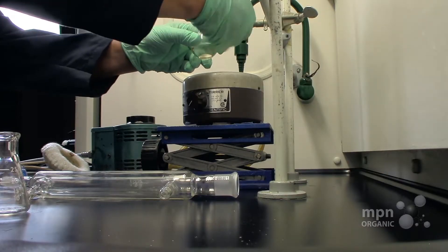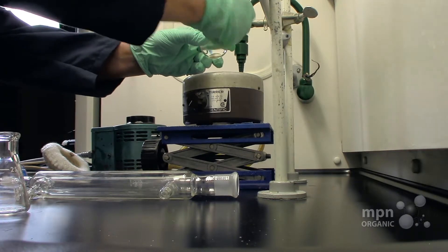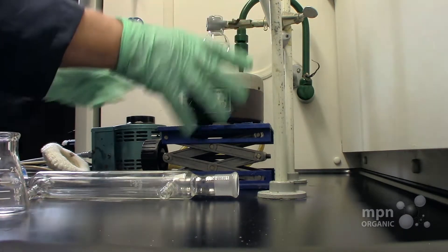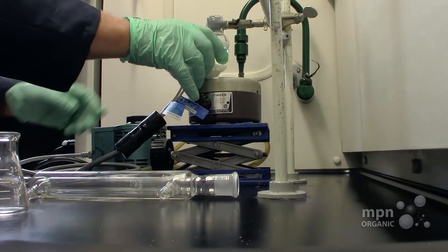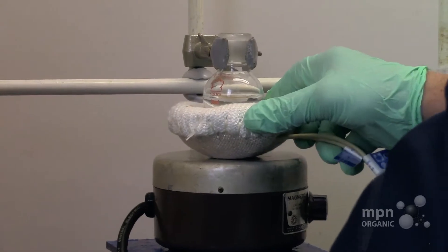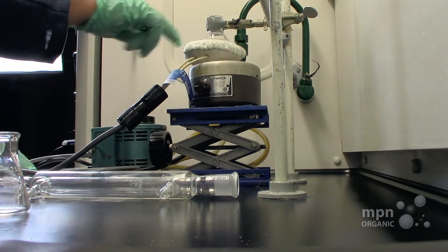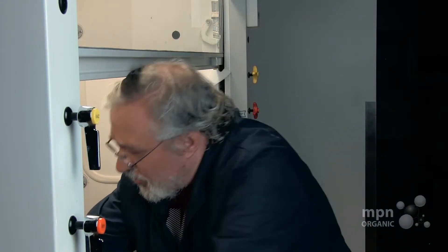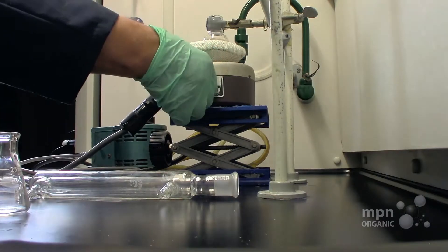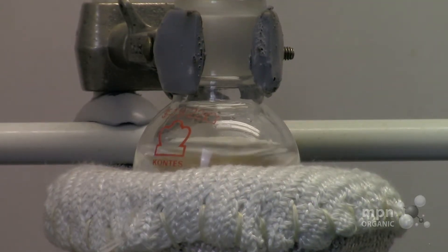We're going to clamp it using a common utility clamp, right there, and then place the heating mantle underneath it like that — it should fit in very snugly. You can see it stirring in there; make sure it sets up a nice vortex. You can make that a little bit tight as well.